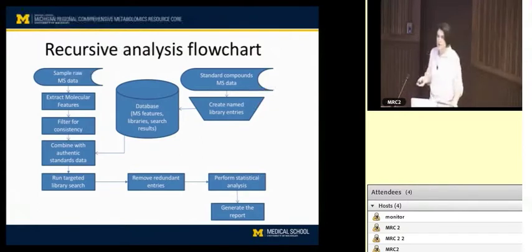I think you run into the difficulty that when you're looking at a blank, without a person really looking at it, you don't want to get rid of good data. So you want to be really careful that you're not applying something you're seeing in a blank across the board. I think it's better to build up a library of knowledge of what some of these known unknown contaminants are, and approach it that way. That's how we usually handle it. And I can explain a little bit how we do that later.